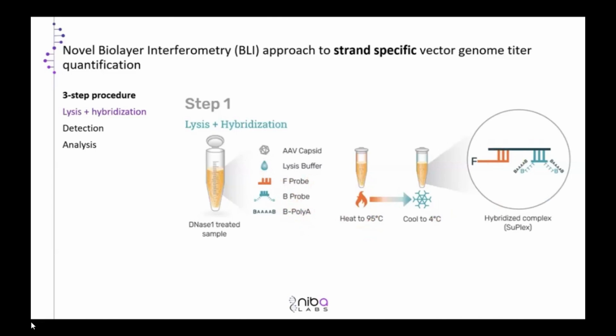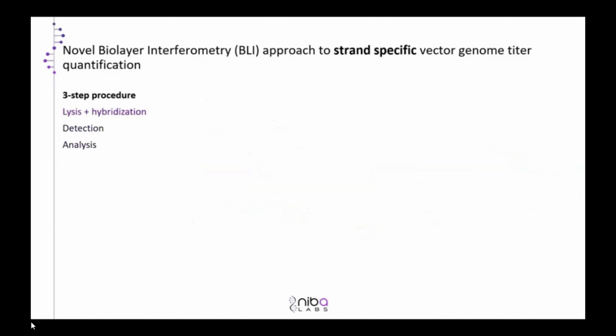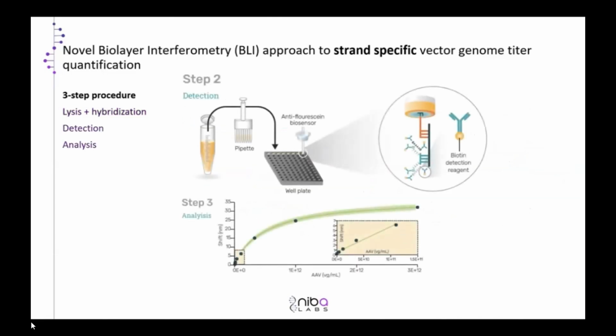What follows are the detection and analysis steps, where we take the hybridized sample and pipette it to the well plate together with the reagents and the substrate.